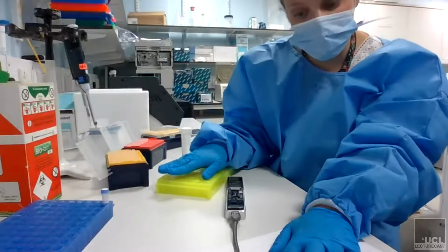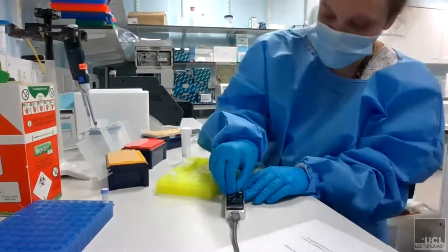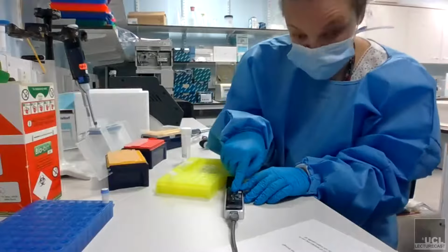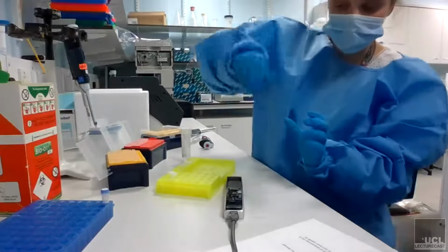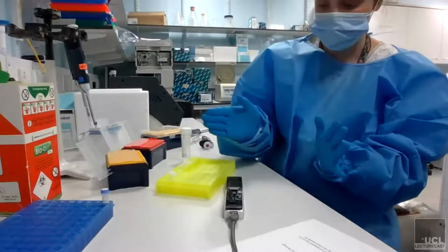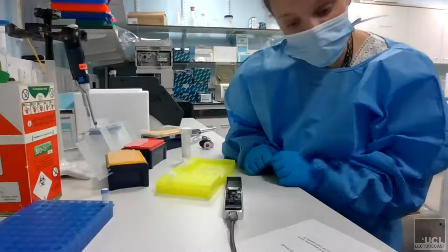So we've added the 800 microliters of the priming mix, and then we've made up our library. Now we can open the spot-on hole, which is where our sample will be dripped in. There's a difference between the way you add the liquids. With this one, you use the pipette to push it in. With that, you just drip it on top, because the primary aim is to not put bubbles onto the pores.